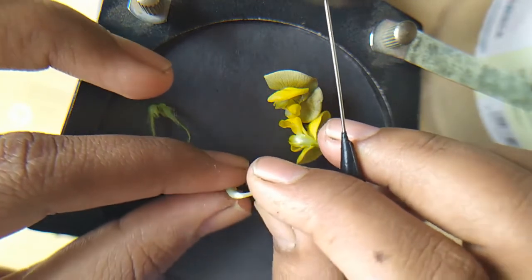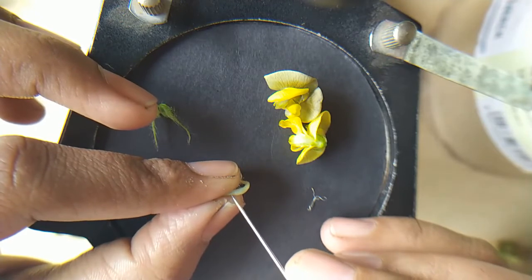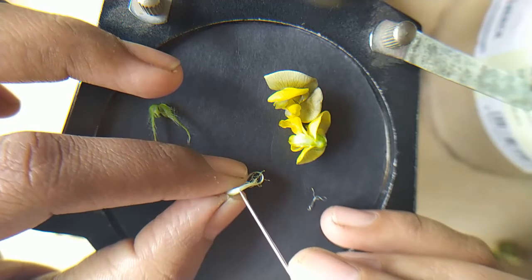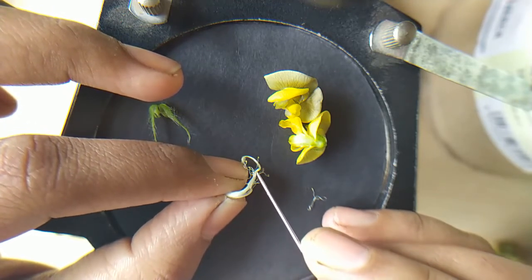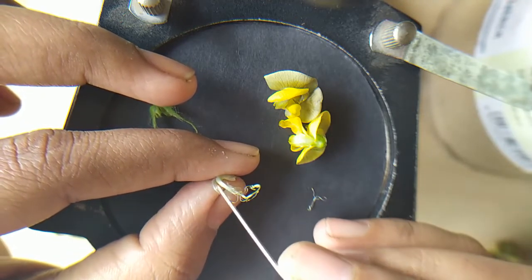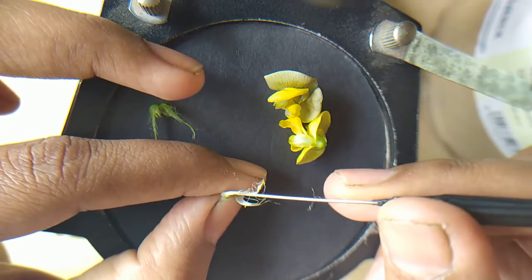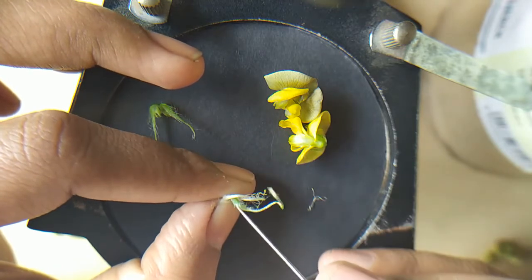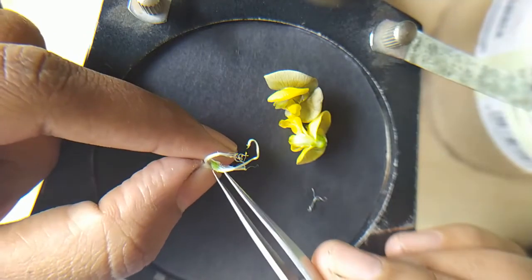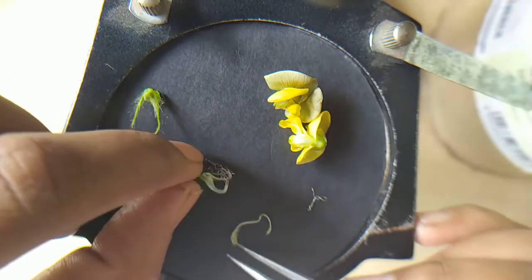While removing the gynoecium, give a gentle cut from the back of that bunch of anthers and separate it up to the top. Okay, now I have removed it, and then take out this greenish gynoecium from the bunch of 9 anthers. Now I am taking it out. Okay, now my gynoecium is separated. This is the gynoecium, and this is the 9 anthers.